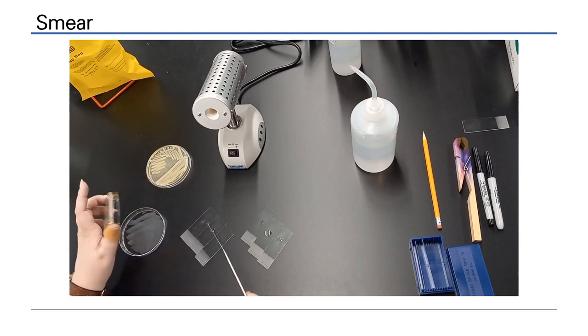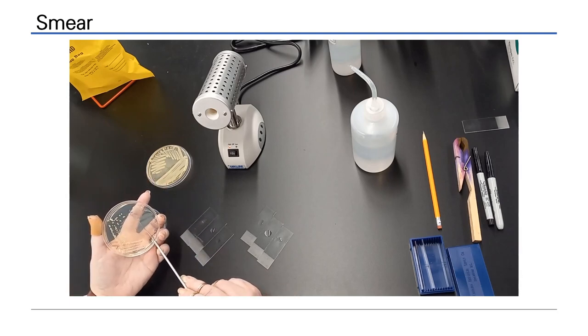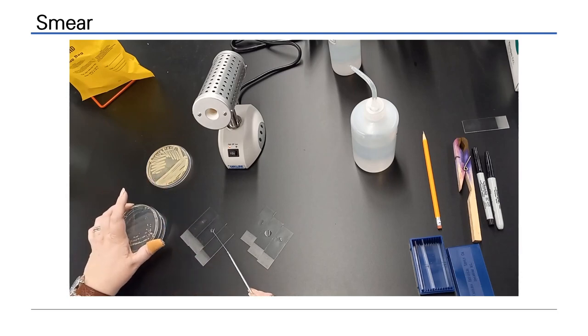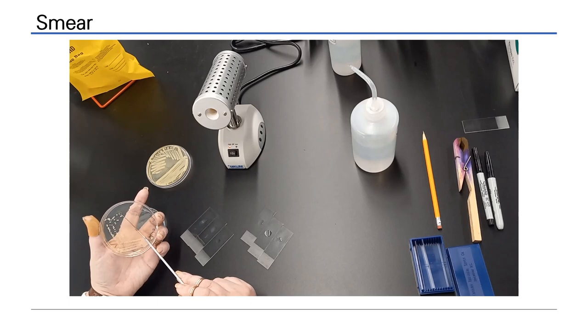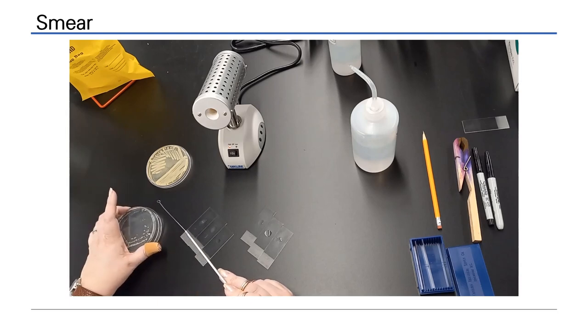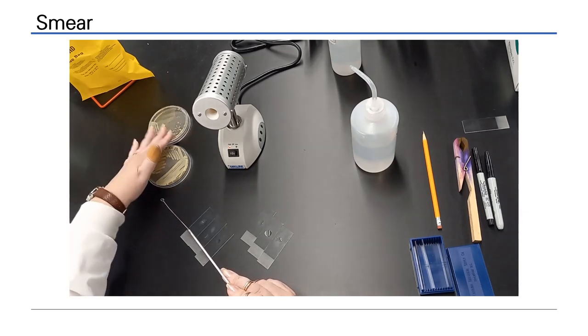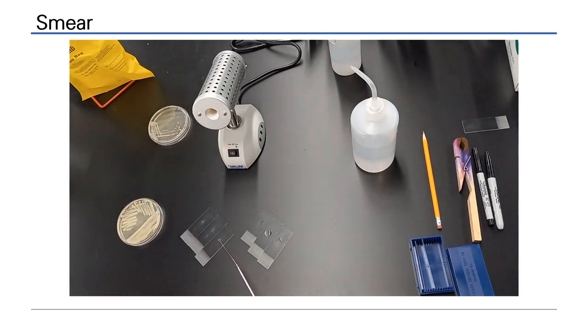Watch how the loop is moved in circular motion to re-suspend the cells in each drop of water. There is no need to re-sterilize the loop between each slide of the same specimen. When all of the drops have been inoculated, it is time to do the smear.